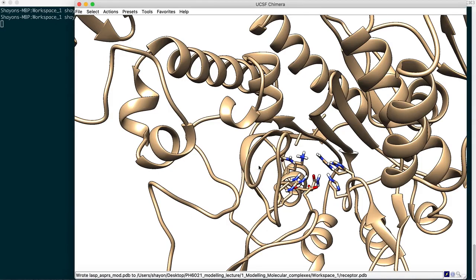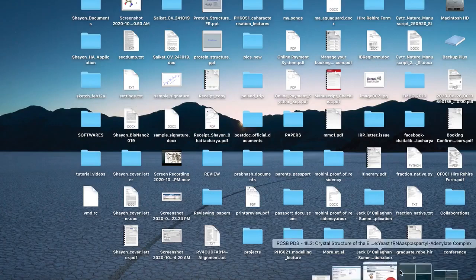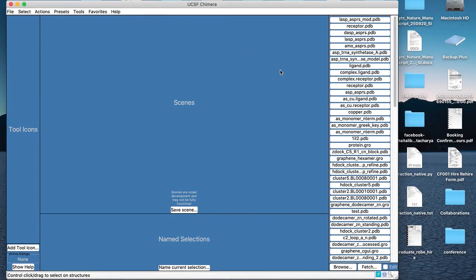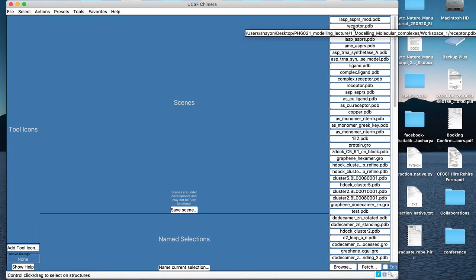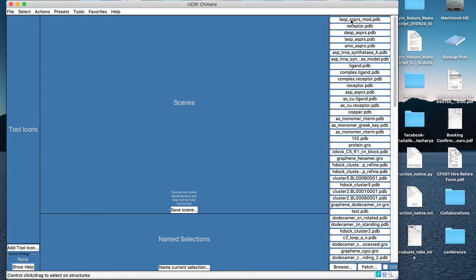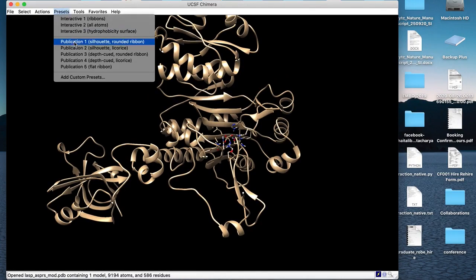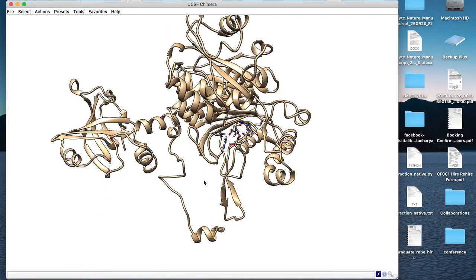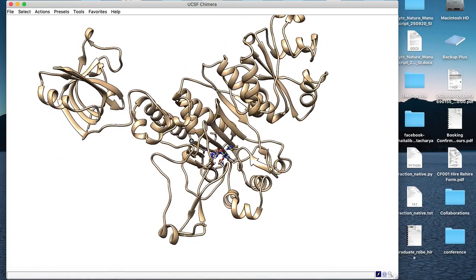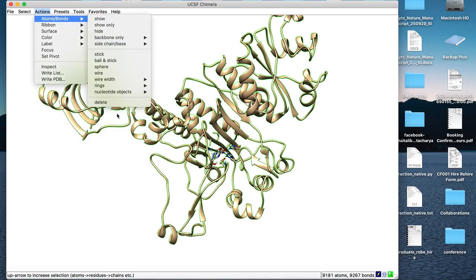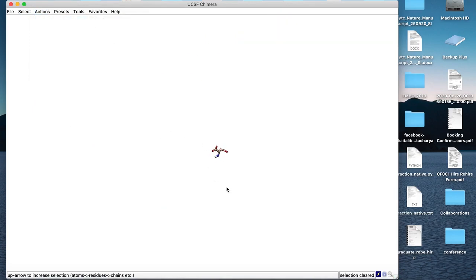Next we need to save the ligand structure, but it's already been deleted. So we close Chimera and reopen it. The receptor structure we just saved is already listed in the history alongside the original complex. We click to open the complex structure again — the ligand is intact. Change the preset to Publication One with white background. Now we'll delete the receptor and retain only the ligand: Select > Chain A (receptor), then Actions > Atoms/Bonds > Delete. The receptor is gone; only L-Asp remains.